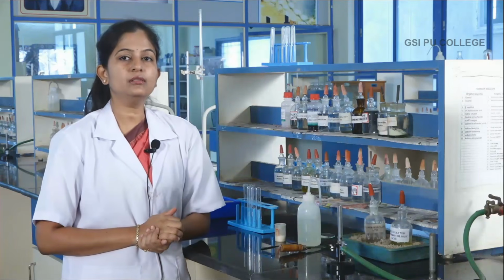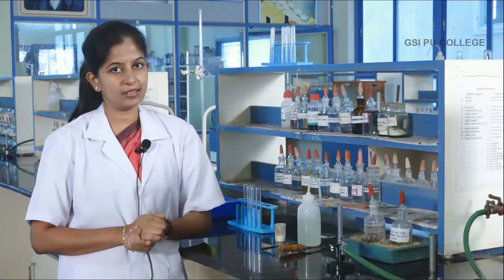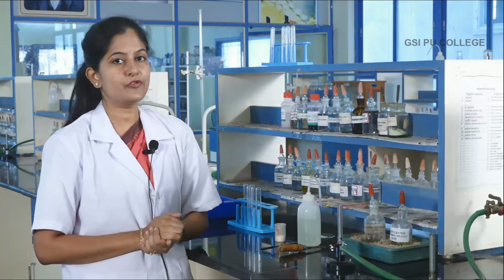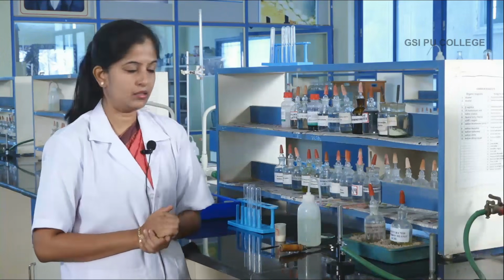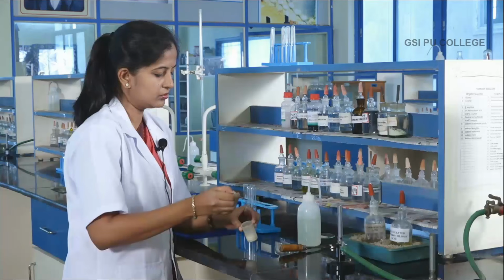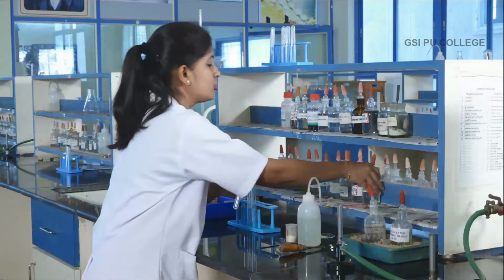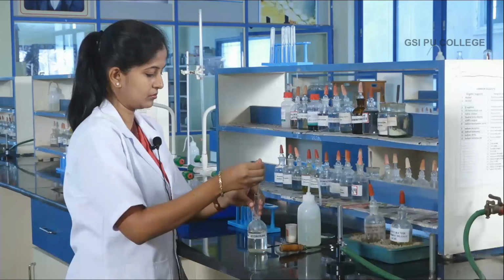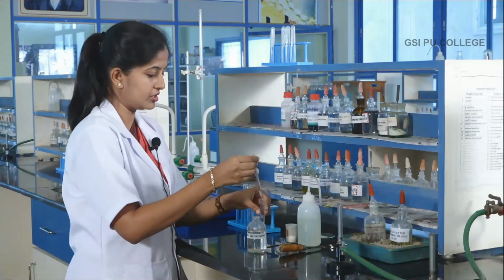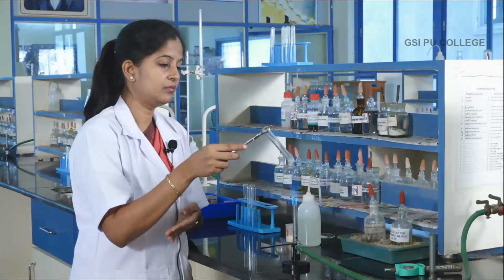Now, let us move on to the analysis of basic radicals. In the analysis of basic radicals, first we have to analyze the zero group basic radical. So, take a pinch of salt, add sodium hydroxide solution, dilute sodium hydroxide, now heat it.